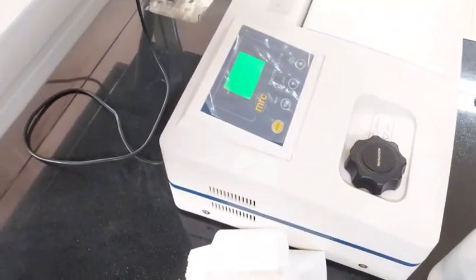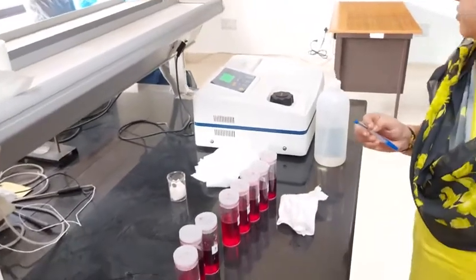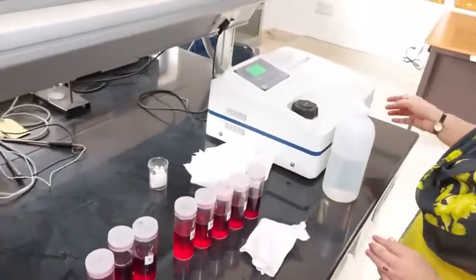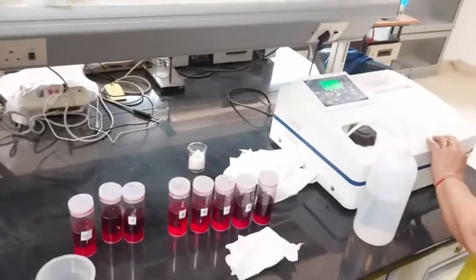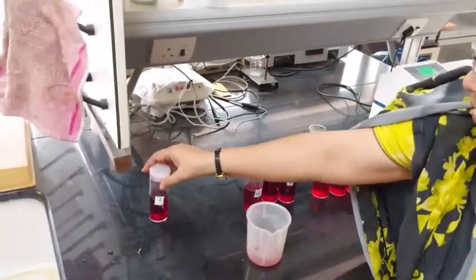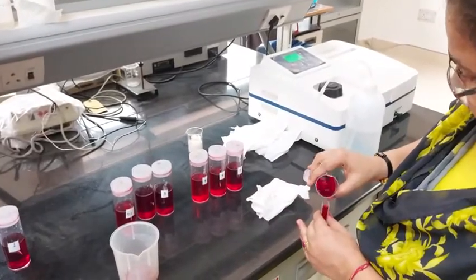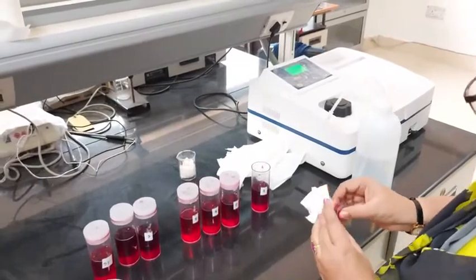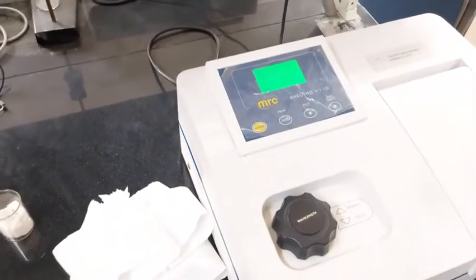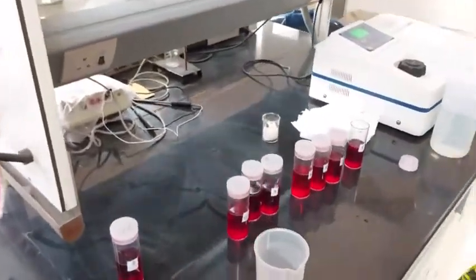It is coming out to be 1.161. The next standard is 0.4 milligram per liter. It is 1.093.